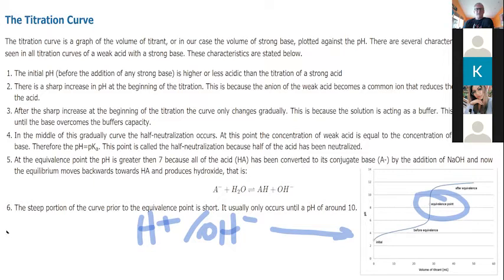Will it just change color by itself? Like as we add the hydroxide? Mm-hmm. What will happen as we add the hydroxide? The pH will increase, but why will it change color? Will it do so all by itself?